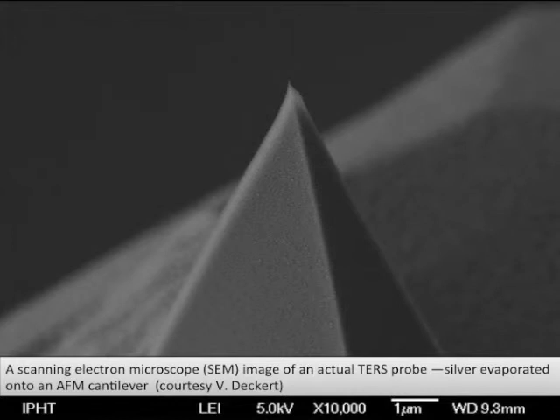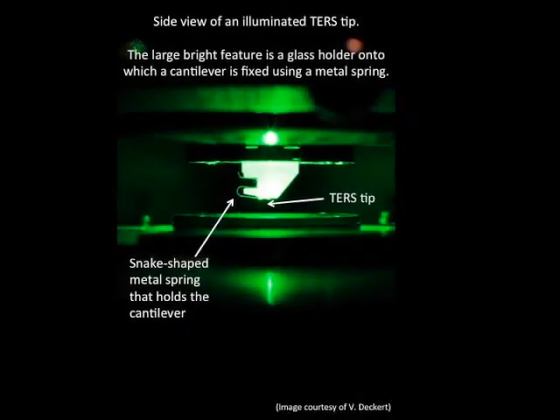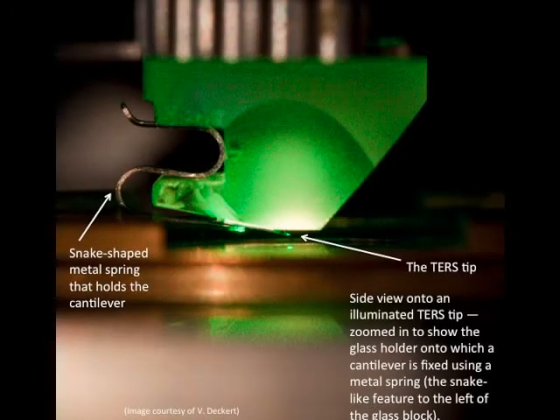Therefore, ideally we have a flat surface, and in that case, always the same part of the nanoparticle is contacting the sample, which yields a very reliable enhancement of this single particle. This is a bit in contrast to SERS, where the sample might be right on the particle, beside the particle, or even between two particles, and that's causing slightly different enhancement features. So that's, in short, the similarities and the dissimilarities of SERS and TERS.